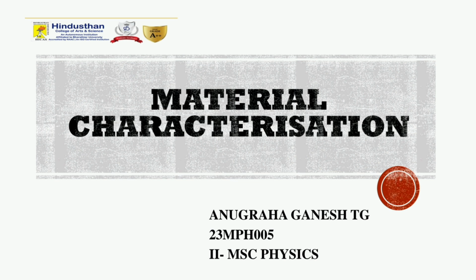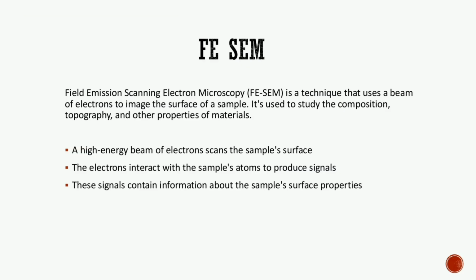Today we are going to discuss the topic FESEM and EDAX. So let's see what FESEM is. The expansion of the term FESEM is Field Emission Scanning Electron Microscopy, which is a technique that uses a beam of electrons to image the surface of a sample. It's used to study the composition, topography and other properties of materials.